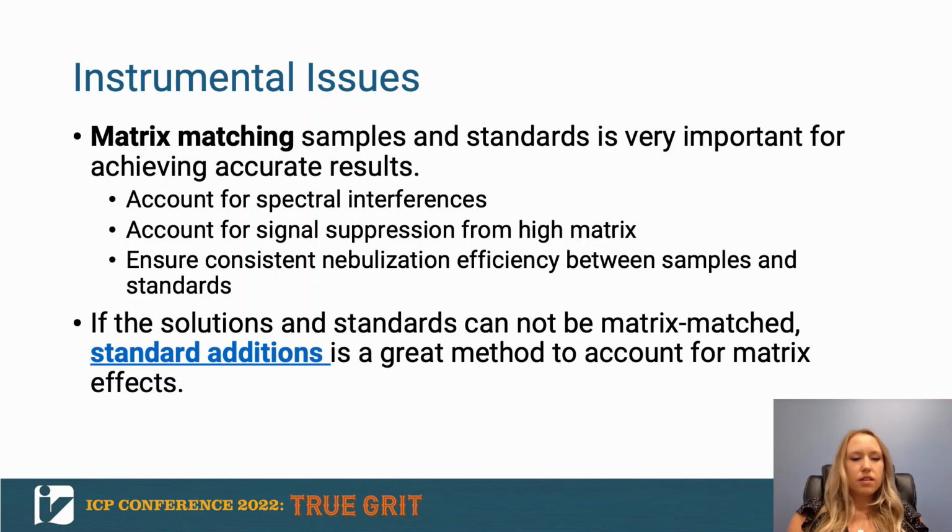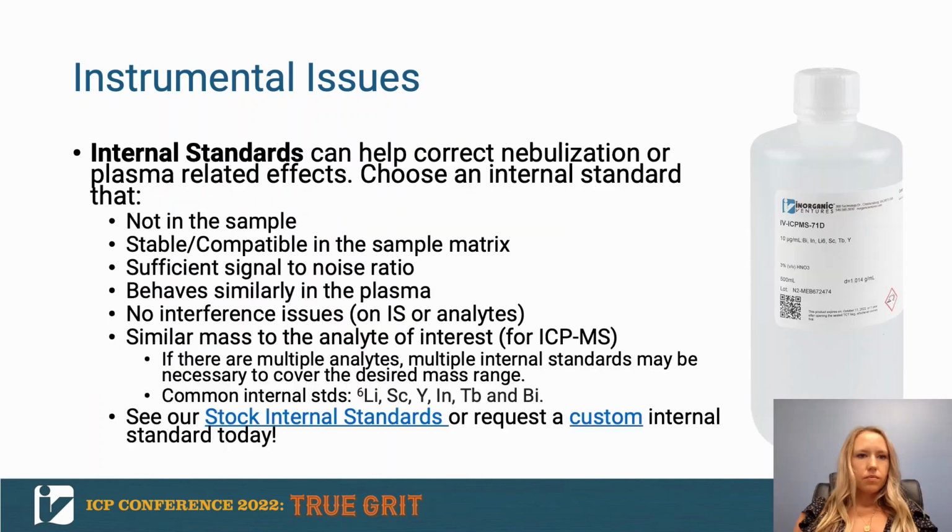So I've linked our webpage that gives you some tips on running a standard additions method here on the slide. This is going to be a really good option because you spike your standard directly into your sample, so you're not going to have any of those matrix effects causing issues for the analysis. But it does take a little bit longer to do your data workup and your calculations. So definitely check out this webpage if you are having issues with performing a standard additions analysis.